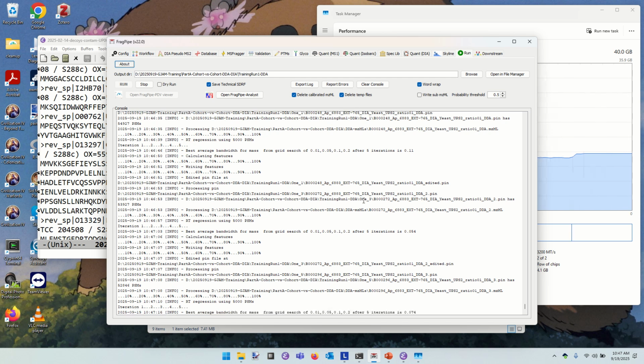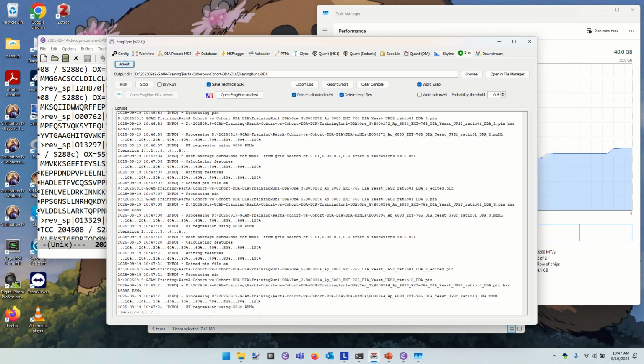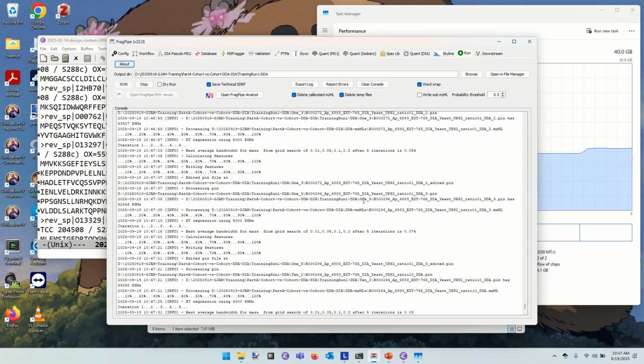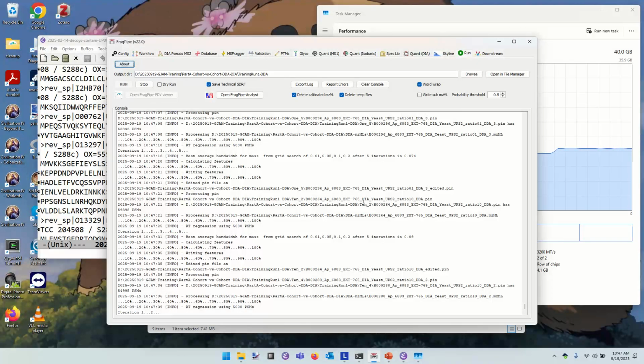And out of curiosity, how is this analysis that we are doing in FragPipe different from what the mass spec facility provides us? Very frequently, the mass spec core facility is going to produce DIA type experiments rather than DDA. So the latter half of this morning will be more relevant to that. They don't use FragPipe in their data analysis.